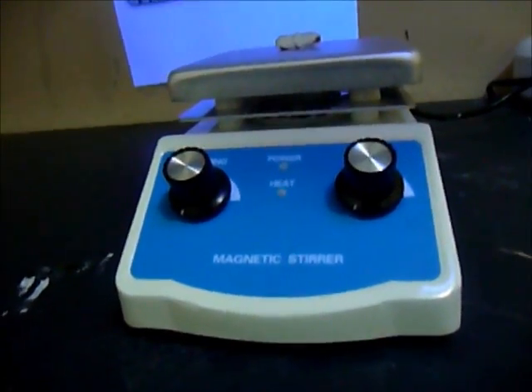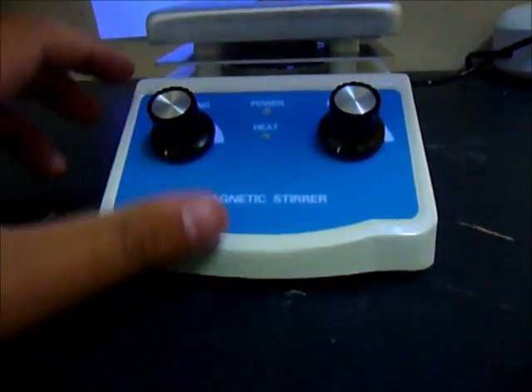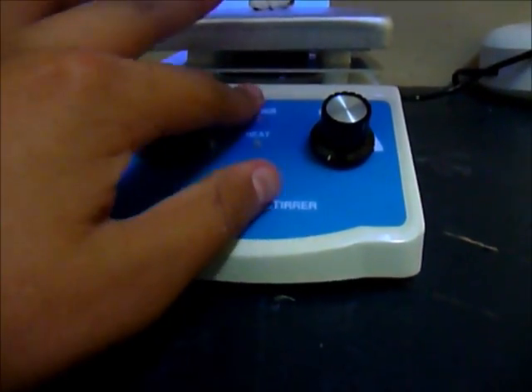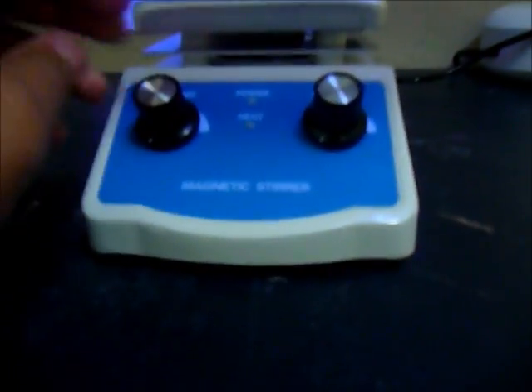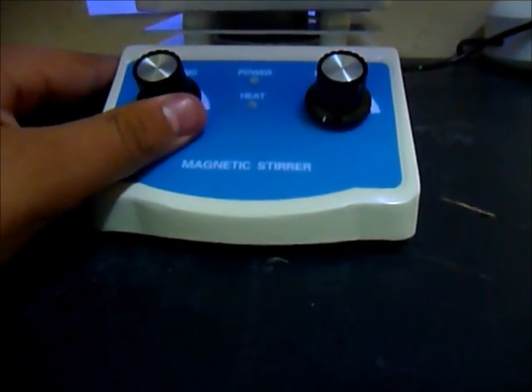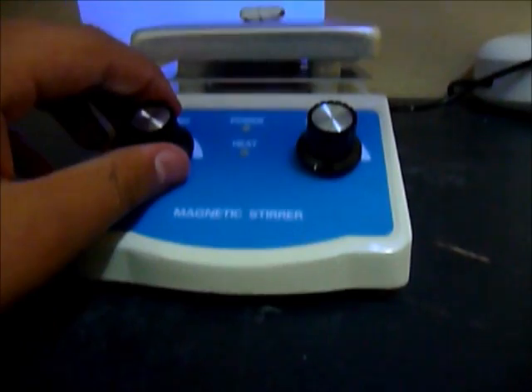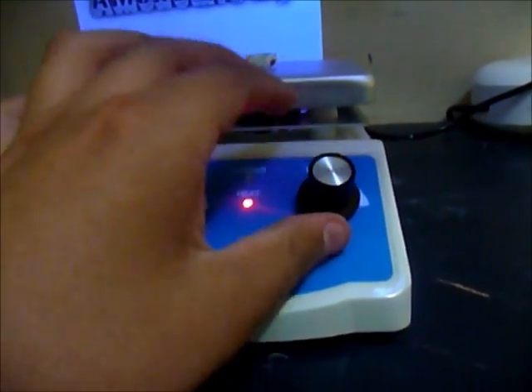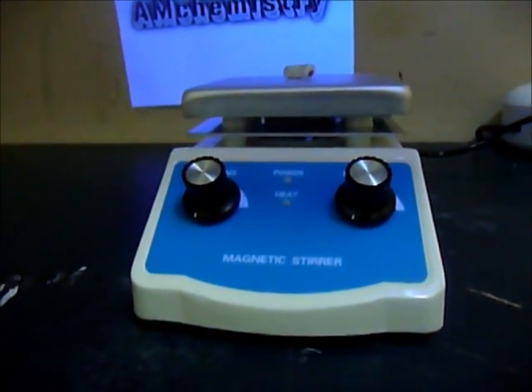Hey guys, today I'm going to be showing you my new hot plate stirrer. This stirrer cost me about $116 plus shipping, about $120. You can put it on stirring or you could put it on heating. This is pretty cheap. I bought this from Home Science.